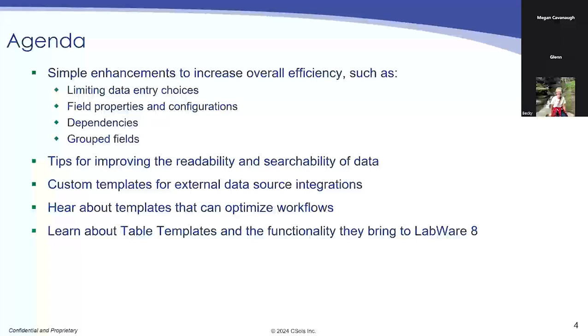See how to use some custom templates to map external data source integrations. I'll give an example and talk about how a custom template was created for instrument integration. It allowed for the flexibility of the instrument to give different file formats so that they could test out different methods of using that instrument so they could get their value out of it, because they were expecting to do a large implementation of it.